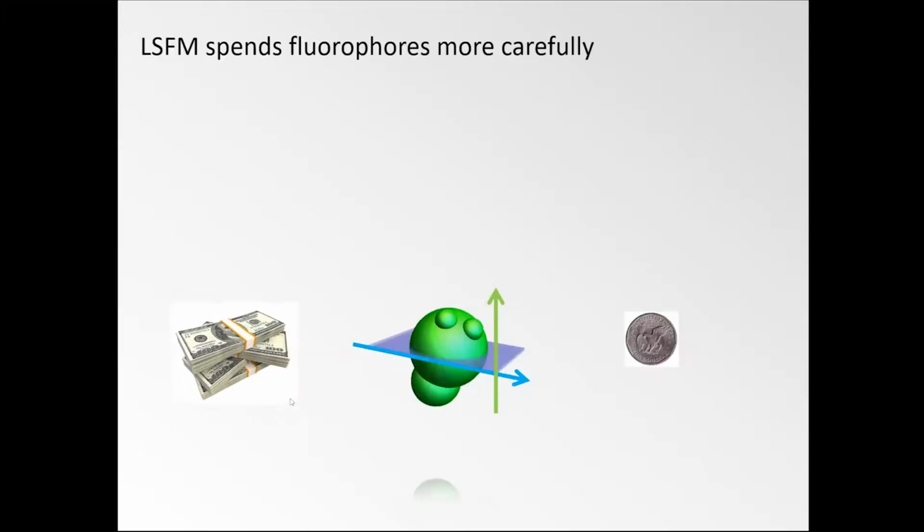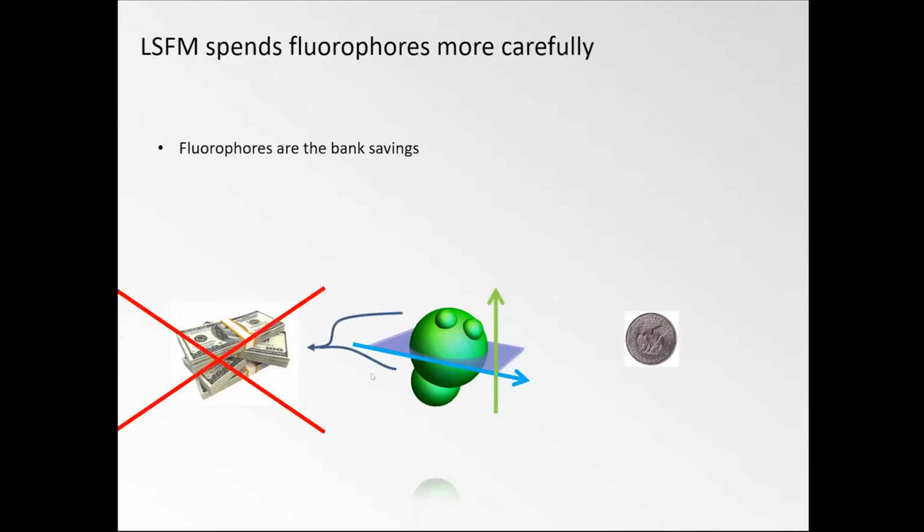And so the light sheet microscope is close to a bank that we're actually using. So when you make a withdrawal, you actually almost pay no commission. You only get photons that you actually use to form your image, and you don't withdraw any fluorescent photon from above and below. So you can essentially get them once you move the light sheet there and acquire the new image.